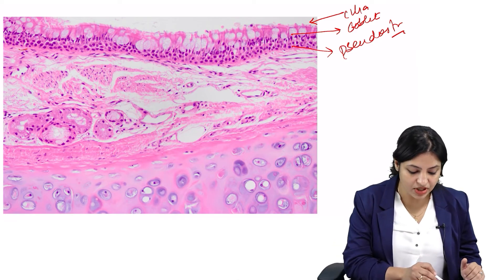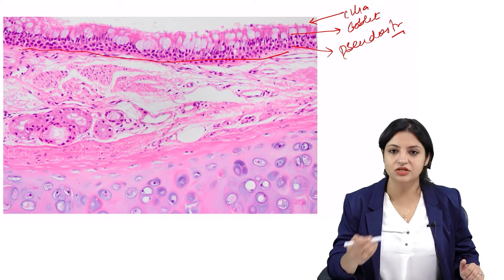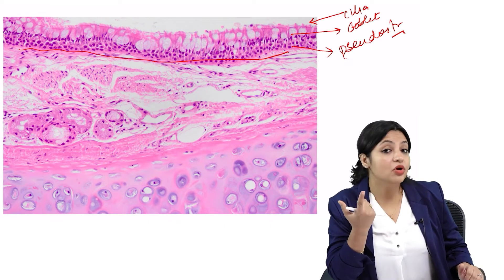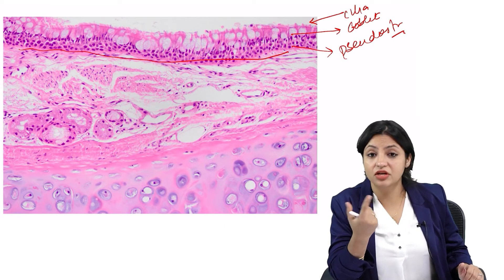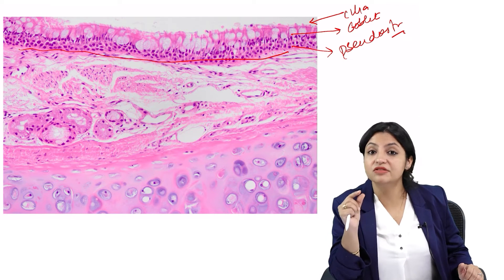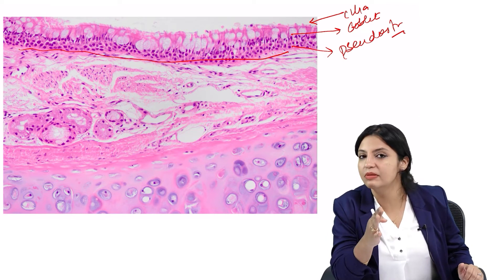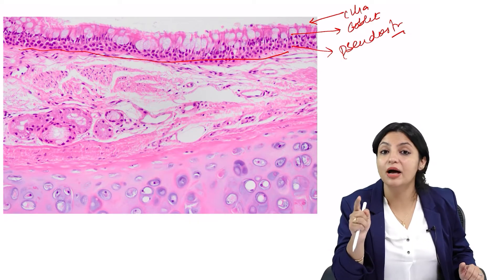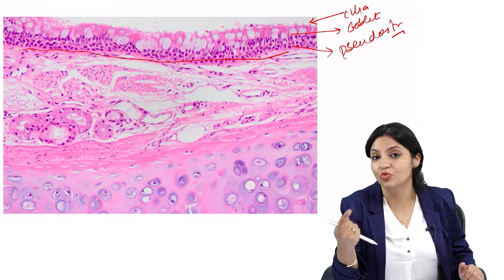Now look at the basement membrane — this is the normal thickness, it is not very thickened. Later, when you see a slide of asthma with airway remodeling, you will see the basement membrane is very, very thick, so you can immediately identify that the basement membrane is thickened. This can happen only when you keep seeing more and more slides.